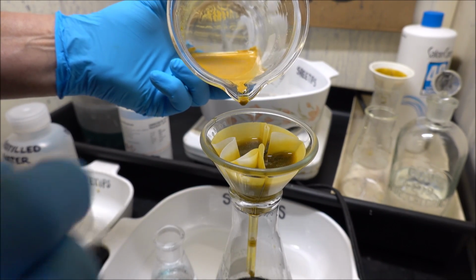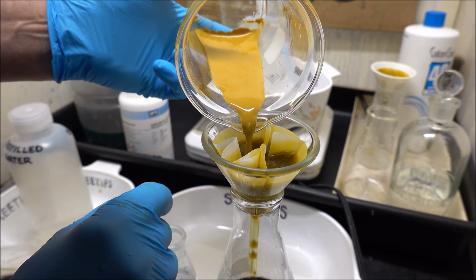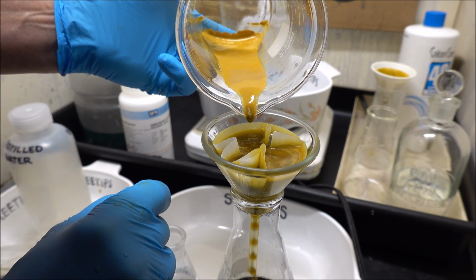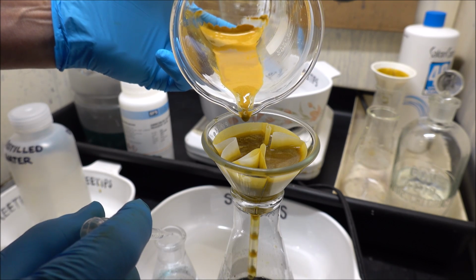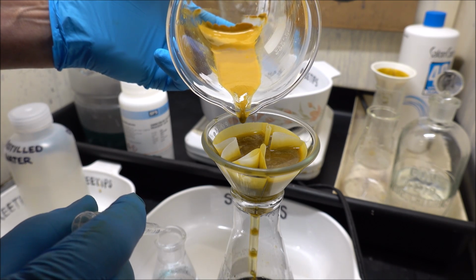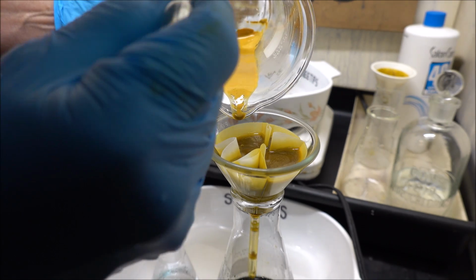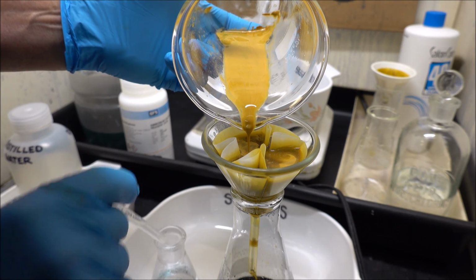Whoops. Rinse the platinum salt out of the beaker. Once again, this platinum salt right here is soluble in water, so water can't be used to rinse it out of the beaker. It'll dissolve, go back into solution if you try to use water.